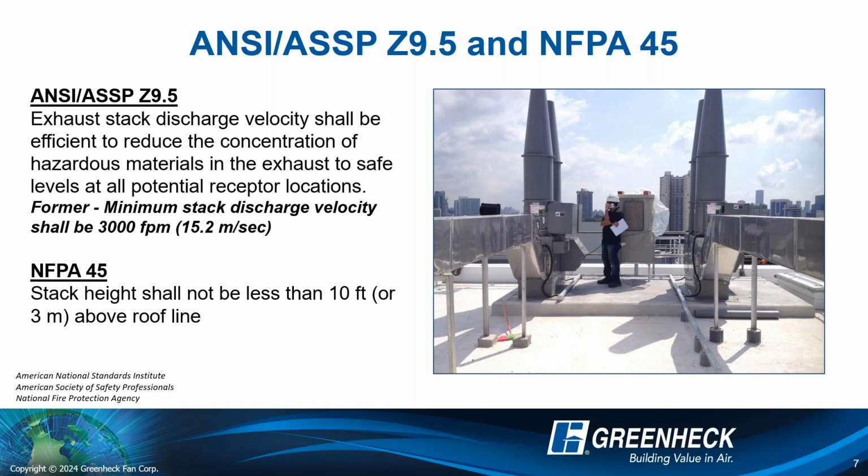That standard has actually now changed in the industry. That standard is now up to you, the designers of that lab space, to determine what kind of velocity you need coming out of these fans. Most manufacturers are still going to recommend 3,000 feet per minute or more, just because we know it's safe, we know it works. I mean, it's been used for quite a while.